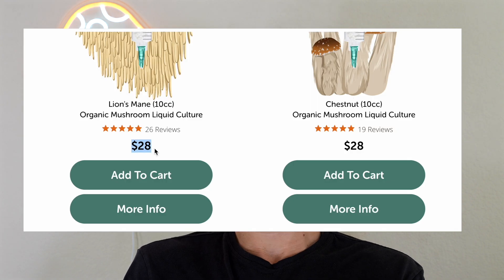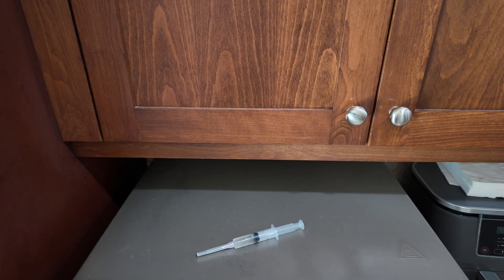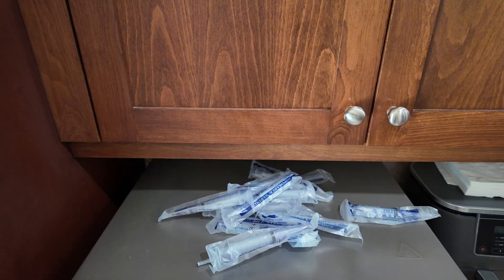Most people buy these liquid culture syringes online for about $30 plus another $10 for shipping, which is fine if you're just going to do one or two here and there. However, if you're planning on doing this more than once or twice, it becomes so much more cost efficient to take one of those syringes and expand it out into 50 or 100 different syringes. So let's jump right into which supplies we need and then I'll show you exactly how to do it.